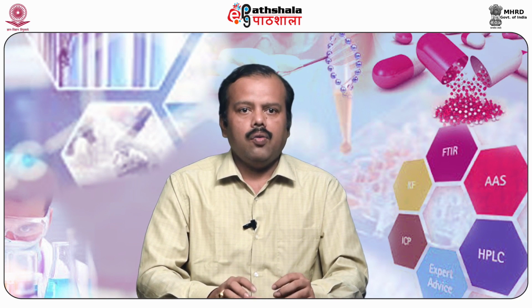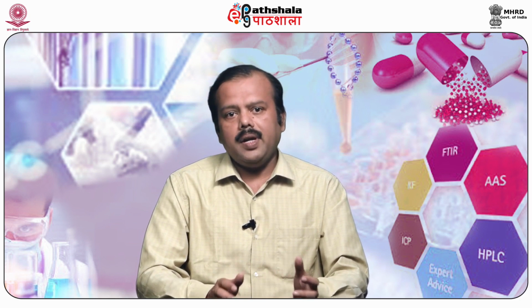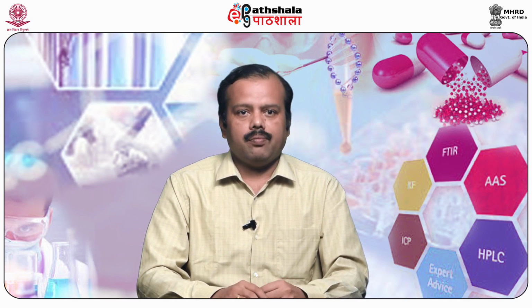The medium components including agar are dissolved by heating in a water bath or by using a microwave oven. Next, the pH of the media is adjusted to the required pH by using 1 normal NaOH or 1 normal hydrochloric acid, using a pH meter or pH paper.